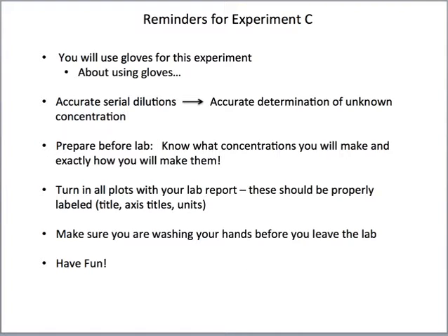Some overall reminders for this: we will be using gloves for this experiment. Copper(II) sulfate solutions are not particularly bad, but it is somewhat toxic, and because of the use of new techniques and graduated pipettes, there's a higher risk of contacting the solution, so we are going to use gloves for this experiment. When you're using gloves, make sure that you're not handling personal items. Anytime you spill something on the gloves, immediately change them out for new ones.